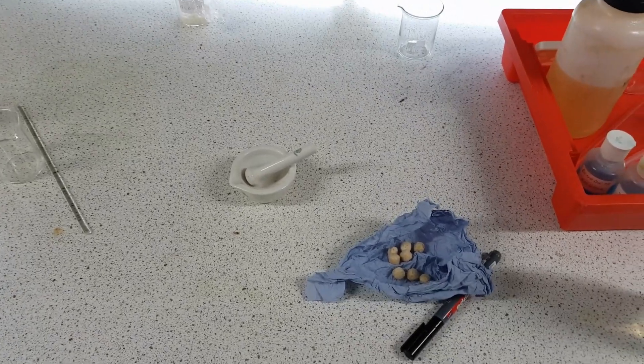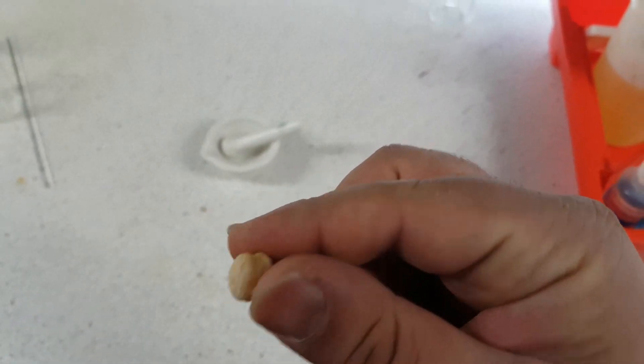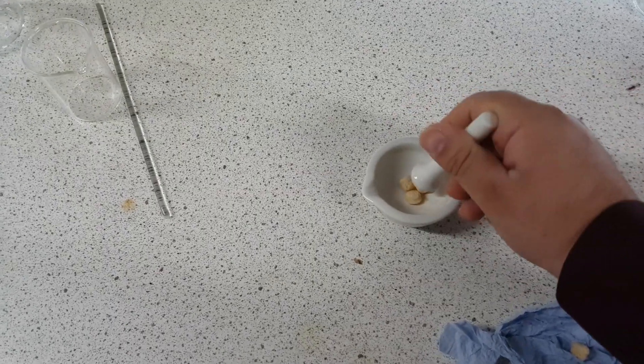Basically, at the beginning I'm just going to show you how to make a solution. This is apparently cereal. I don't know what cereal that is because it looks absolutely nasty, but it was in our prep room so it might be like a thousand years old or something.